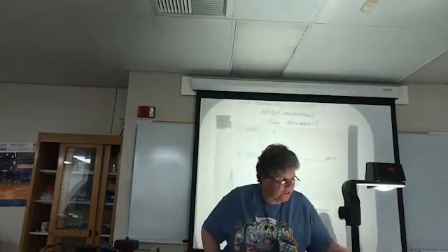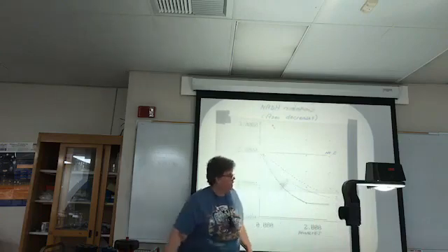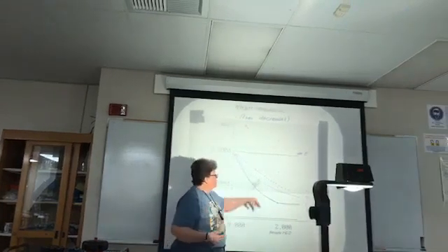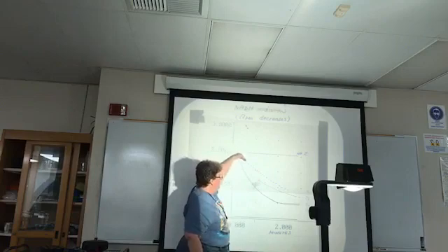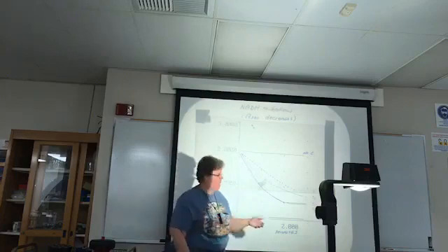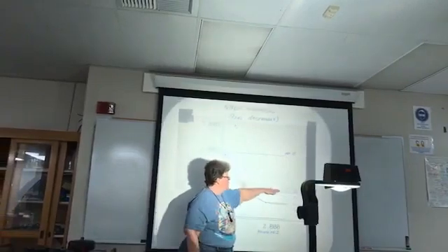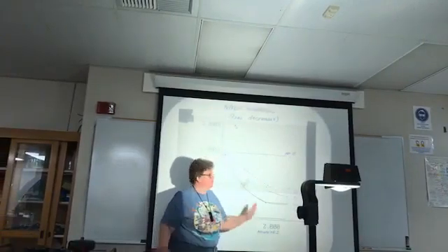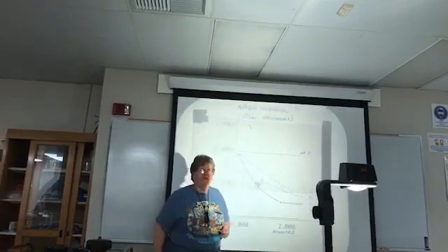So this is an actual example of what it might look like. Now this is with a bunch of different amounts of enzyme. But let's say this was your part A curve right here, where you've added, let's say, 3 microliters of enzyme. You add 3 microliters of enzyme, it starts to go down at a certain rate, and then you see it start to slow, and you say, okay, I've got enough data points to know that I'm no longer in a linear range.